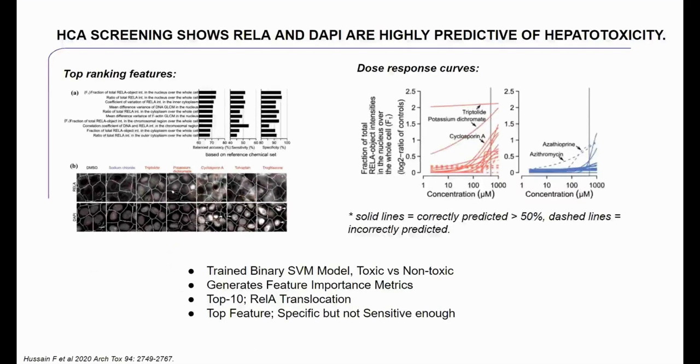and then you train a model over that, and that model can then be applied to other data sets, and you get essentially a measurement of whether those other wells are giving responses that are similar to toxic or to non-toxic.